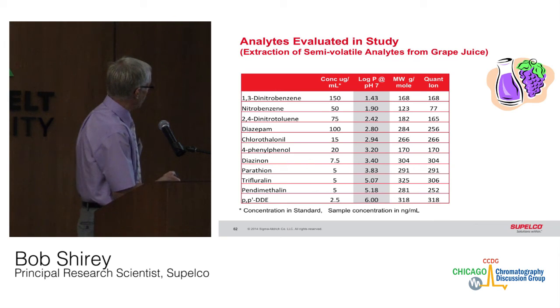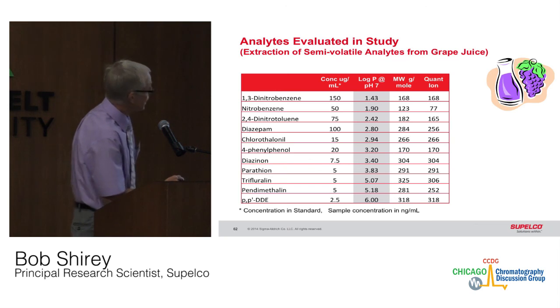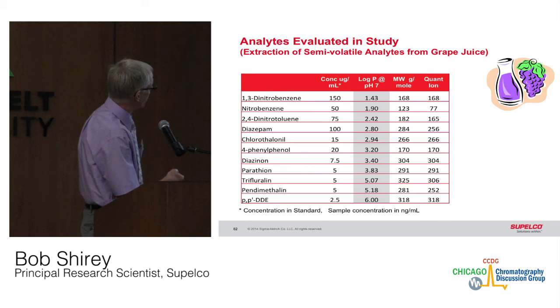We looked at a bunch of semi-volatile components, primarily pesticides and some nitroaromatics. I put these in there because they are much lower molecular weight. Now, the PDMS DVB fiber is not a highly polar fiber, so once you get much below a log P of 1.5, you're not going to extract analytes real well, but it extracts these moderately polar analytes very nicely.